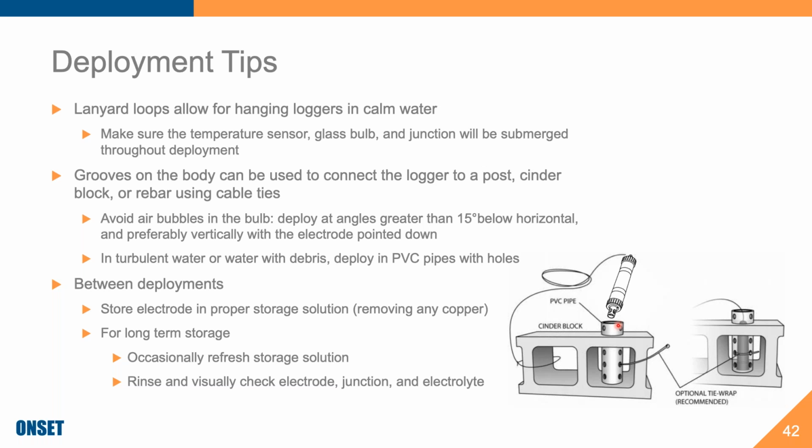That was one manufacturer's recommendation, and I'm not sure I would actually recommend that too much, but it is an option, especially if the manufacturer for that electrode says to do it, then by all means, maybe follow that. But that's for an extended period of time, like several months or the majority of a year. If you store it dry, then it should be okay, and you're saving the electrolyte essentially. But then you'll want to definitely recondition by soaking it in a storage solution for, I would argue, a couple of days before deployment.